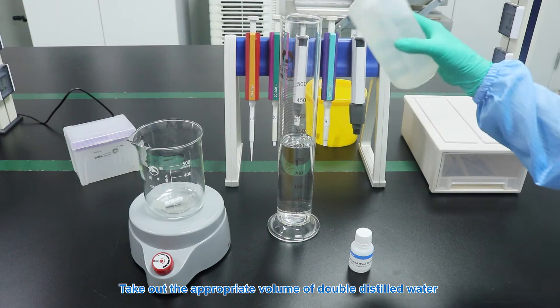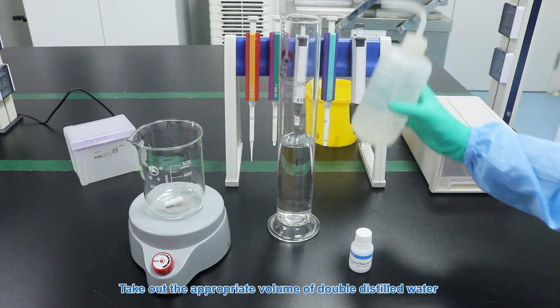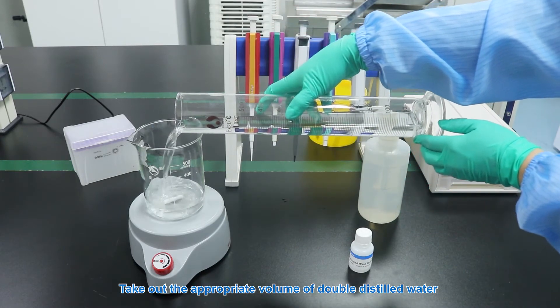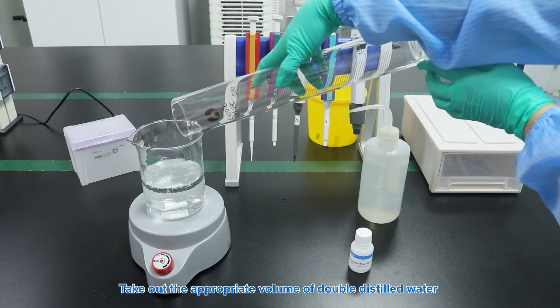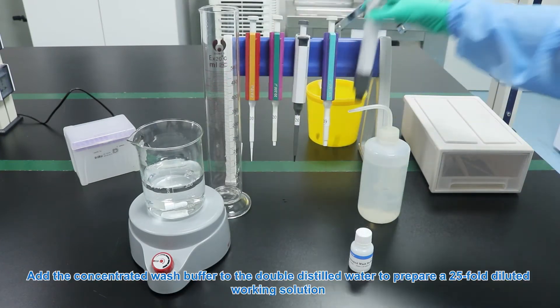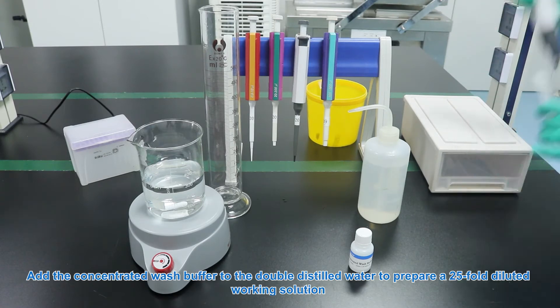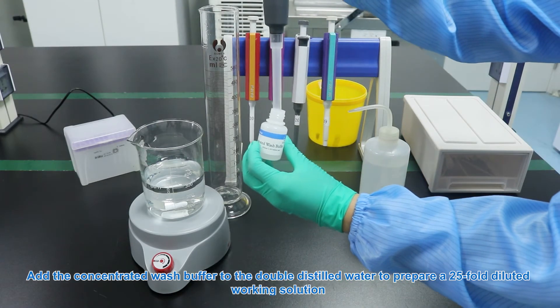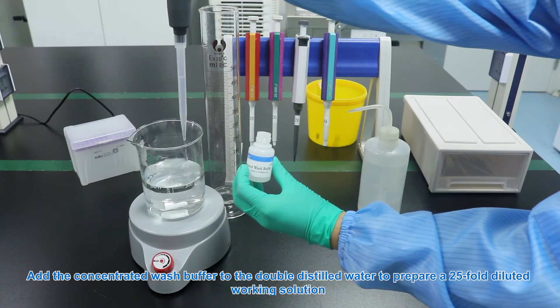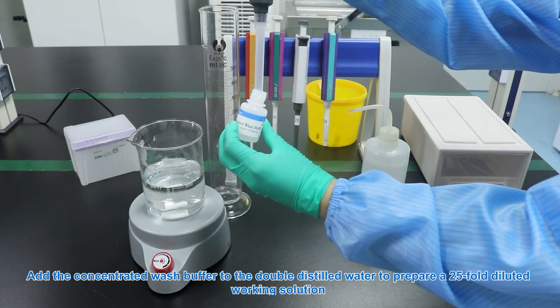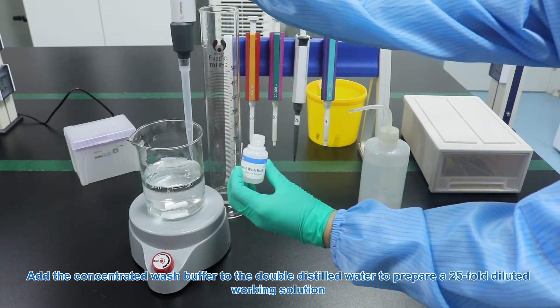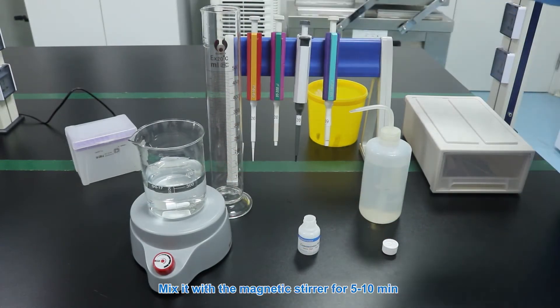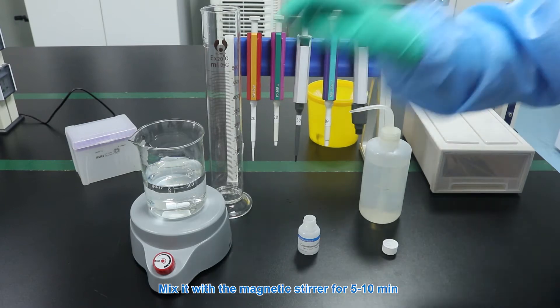Take out the appropriate volume of double distilled water. Add the concentrated wash buffer to the double distilled water to prepare a 25-fold diluted working solution. Mix it with the magnetic stirrer for 5 to 10 minutes.